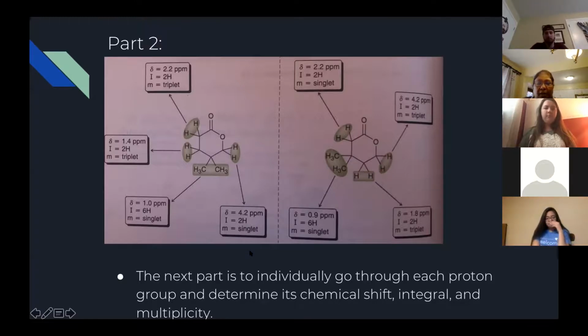Go through the bonds to find out what the neighbors are, because when I look at it, those 2 hydrogens, the last ones, look like there are 6 neighbors, but that's far away. So make sure that you go through the bonds and figure out what your adjacent carbons are, and figure out if there are hydrogens right there. And just make sure you're only going 1 carbon away, because you could get confused. Yeah, that's for the most part how they got those values.